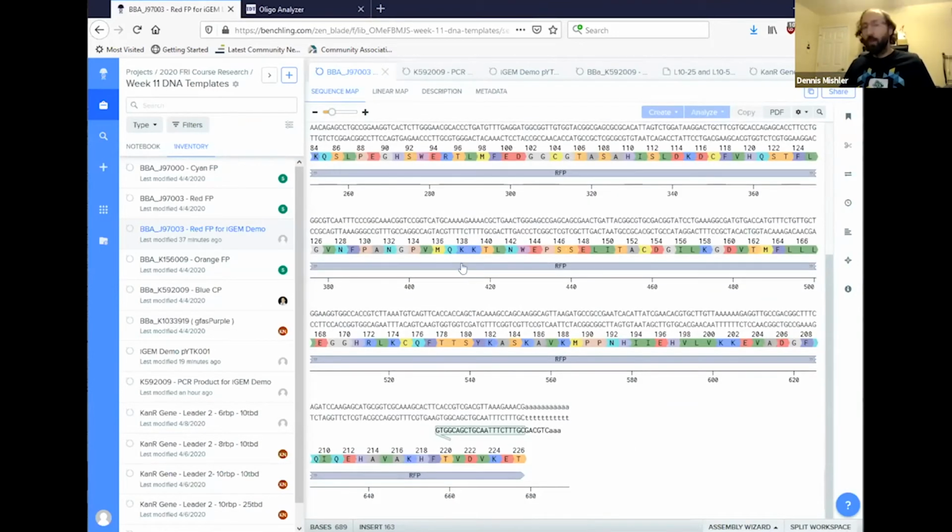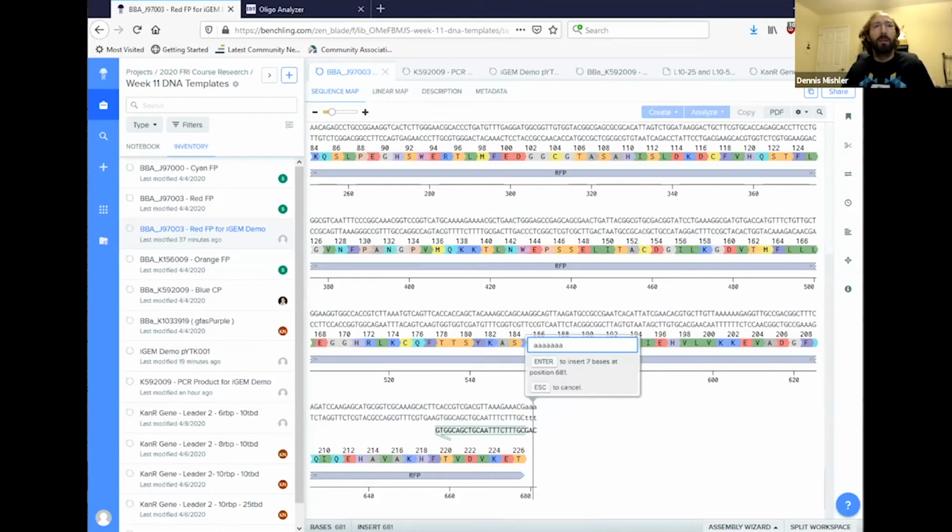I want to show you guys real quick this second sequence here. This is a reverse primer. It's got a couple differences here. First off, I've added some overlap sequence or overhang sequence here, and this sequence is not base pairing to the template. And I want to just highlight this in case you're trying to work on this ever. If I delete these A's here from the sequence, these are just extra A's to show you something. Notice the primer disappears. It's not gone. It's just the way the system works is it doesn't show it. But if I add these A's back, primer's back, okay?